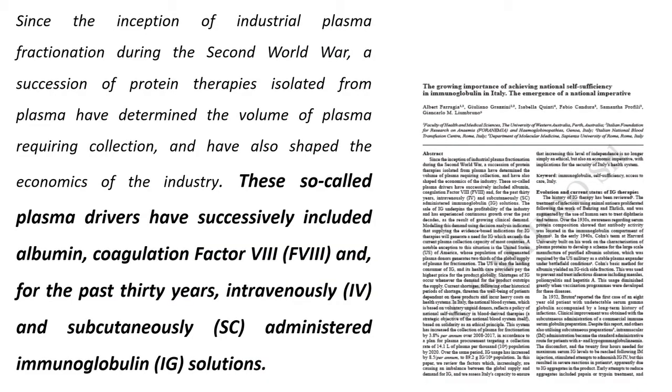I want to now go into the actual products, and I will just remind you that since the inception of industrial plasma fractionation during the Second World War, a succession of protein therapies isolated from plasma have determined the volume of plasma which requires to be collected and have also shaped the economies of the industry.